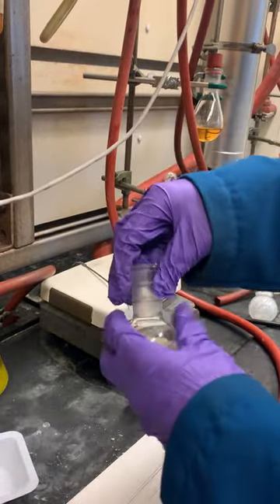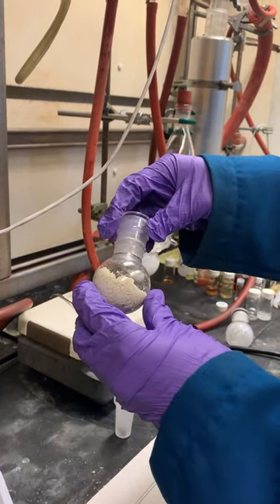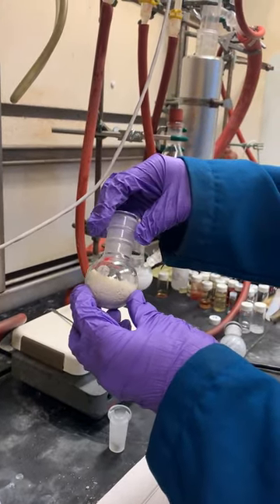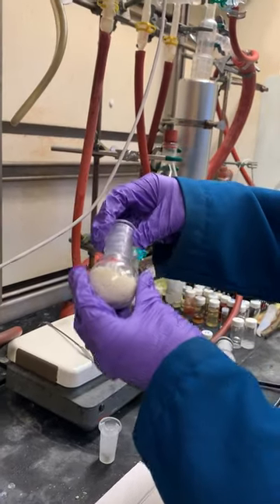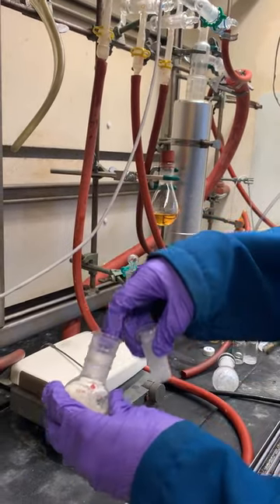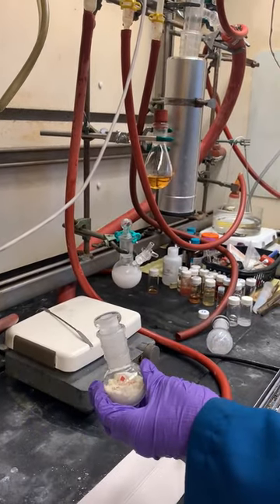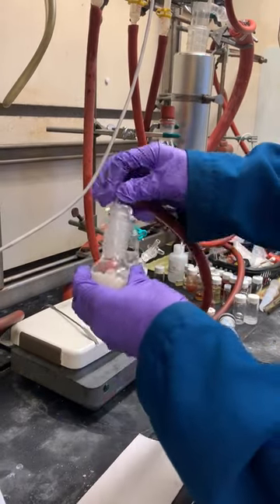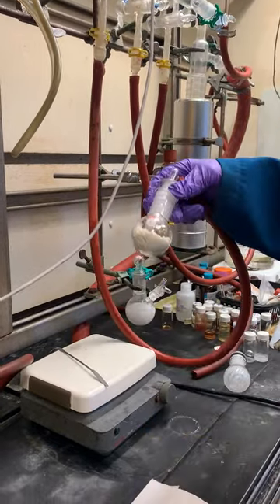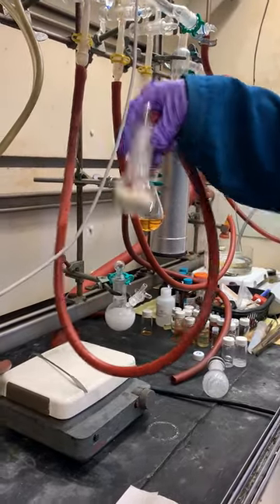There we have our product. We're going to dry it under vacuum at room temperature for a couple hours to make sure all the solvent is gone. If it still looks a little bit yellow, you can rinse it with a little bit more acetone and pipette out the acetone in case there are any remaining impurities from the filtration. For now, we'll just put it under vacuum at room temperature for a couple hours, and then it'll be done — a nice dry off-white powder.